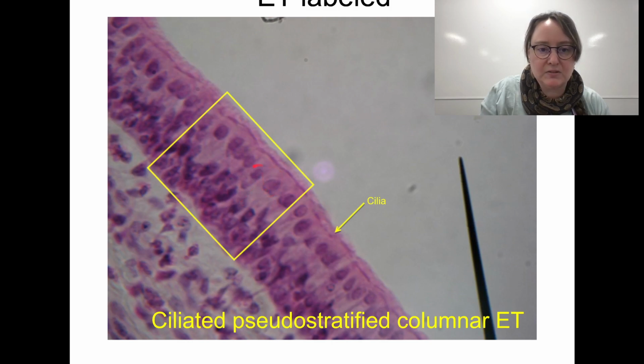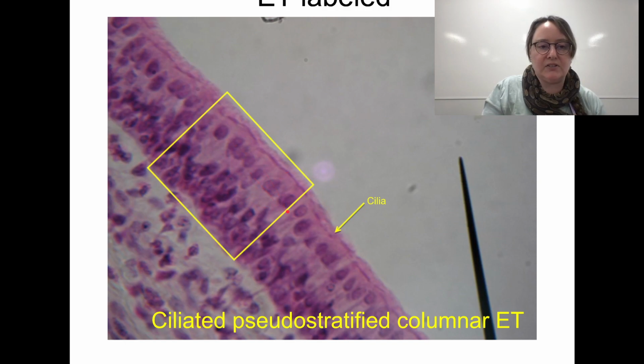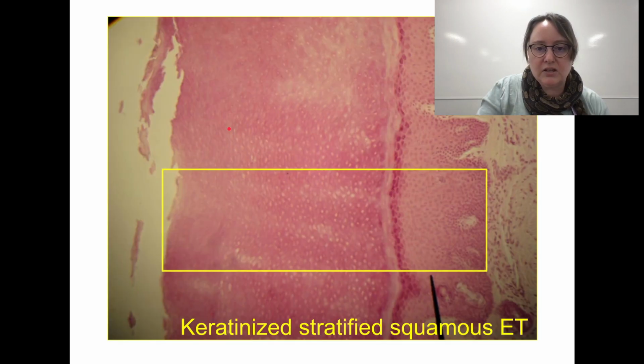See how this one's big, this one's skinny, and that one also, and this one's kind of big. If you can zoom in, here's one right here and here, and they kind of look more like a mess. You can still tell they're columnar, but they're all different sizes. They're not perfect. You know, nothing in your body's perfect.